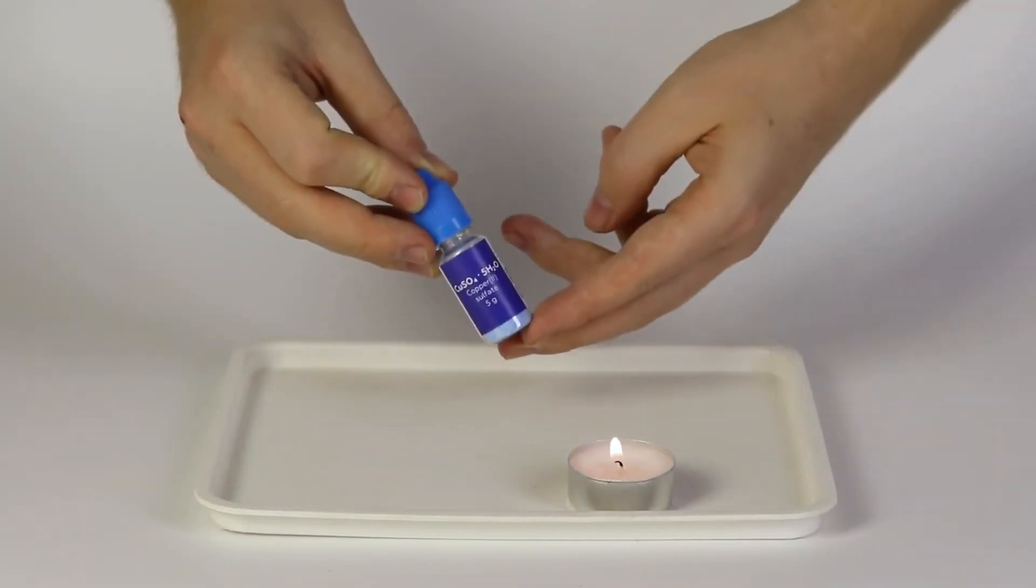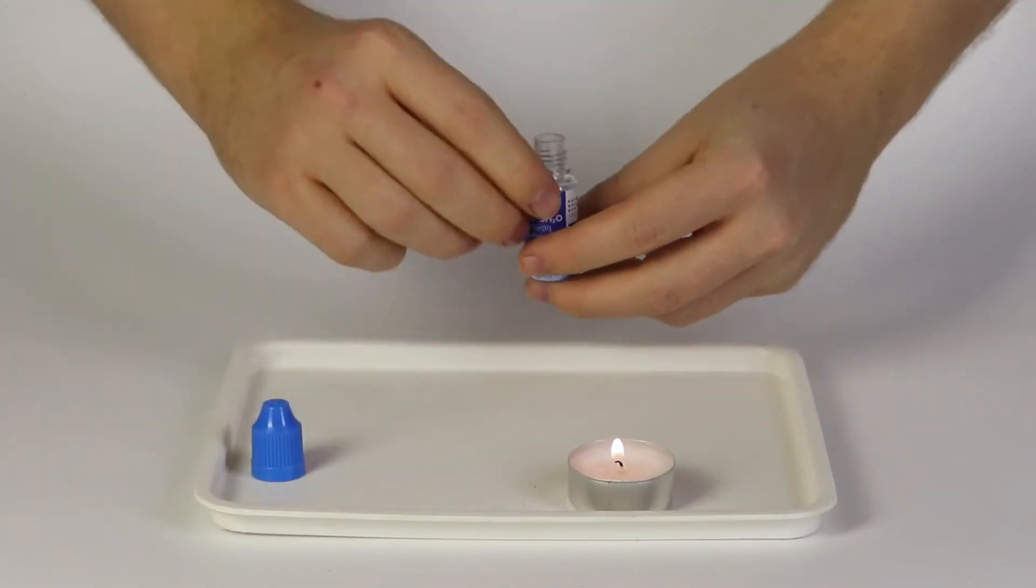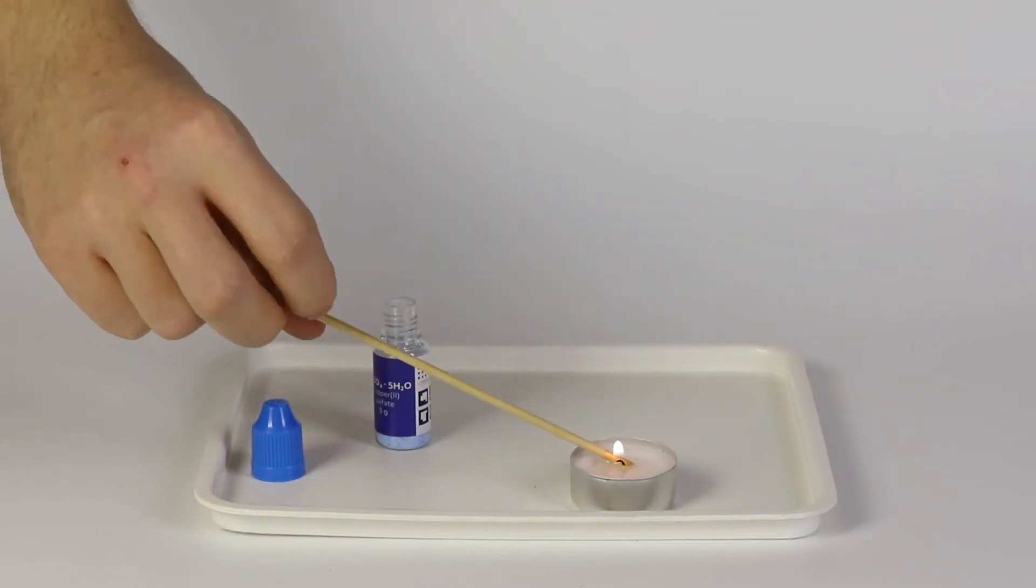Open the bottle with copper sulfate. Take the splint and dip it into the melted paraffin and then into the bottle.